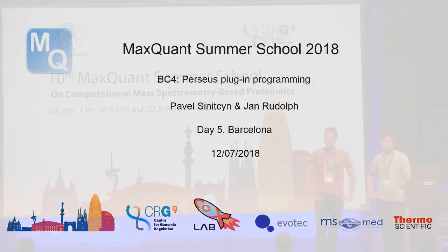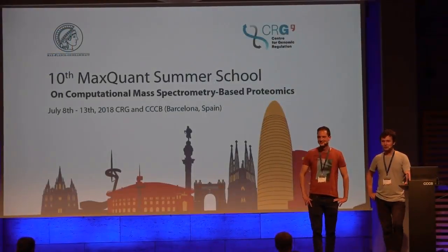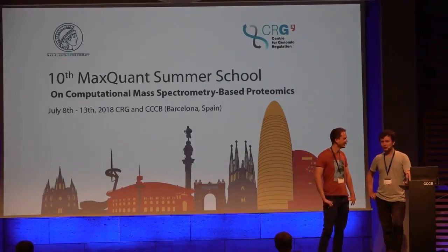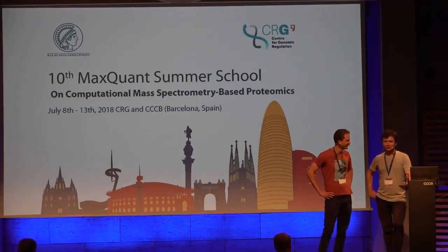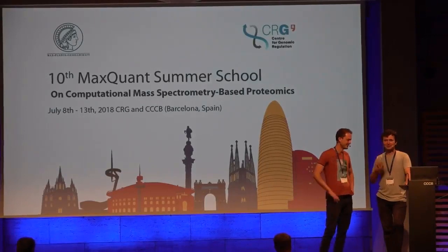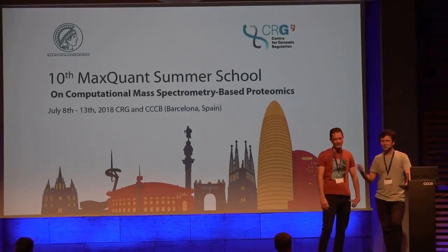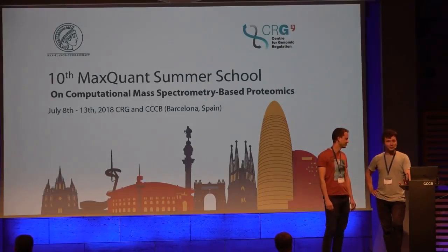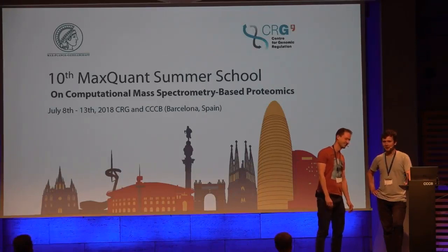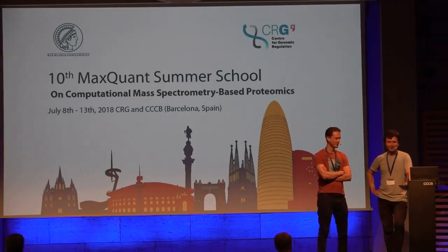This lecture, I will say, bootcamp, it's a bit strange because we are sharing this bootcamp in really some style. We tried it previous time, it worked really nice, and we are playing the game like bad and good policeman. So in certain moments we are going to swap, in terms of showing slides and also policemen. For now I'm good policeman, and Jan is bad policeman. So he's going to ask me many questions, and I'm going to somehow fight against them.